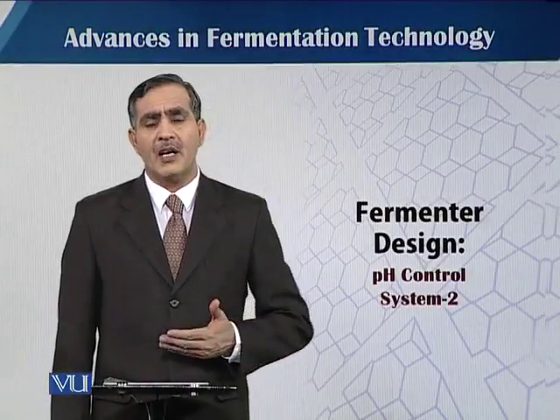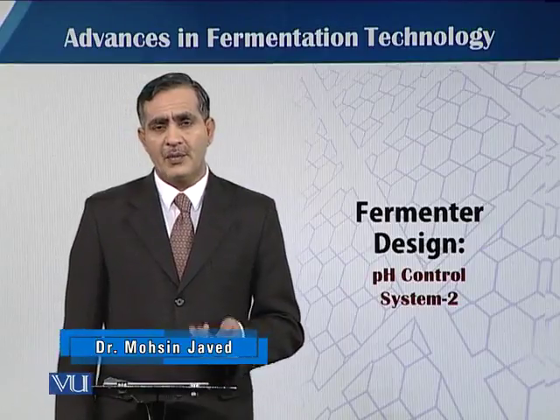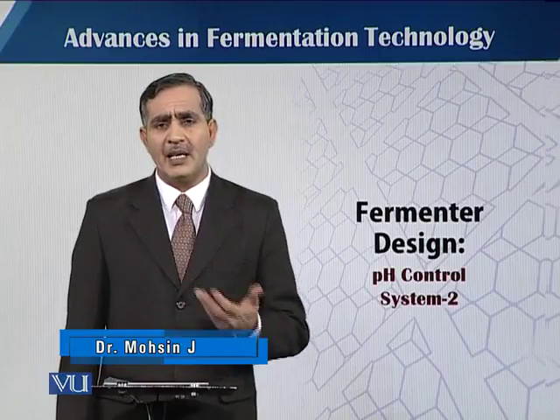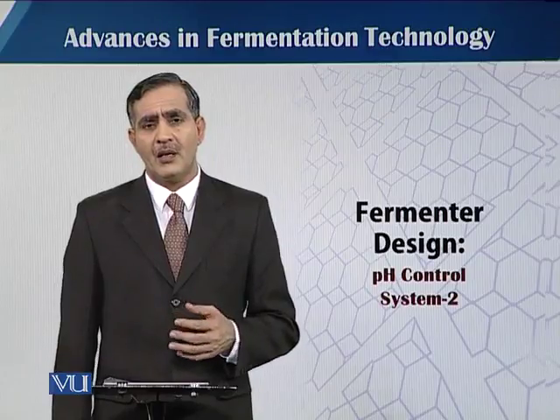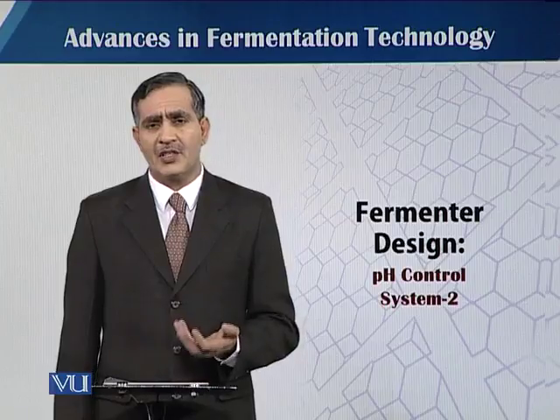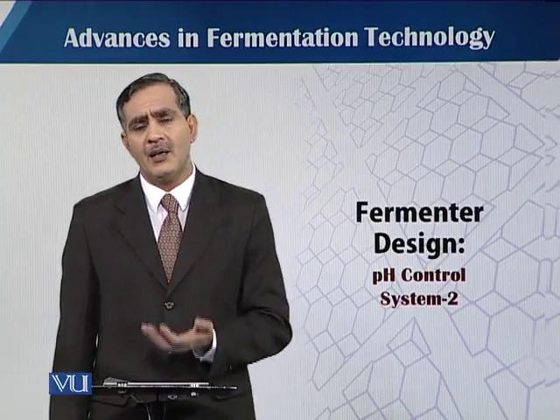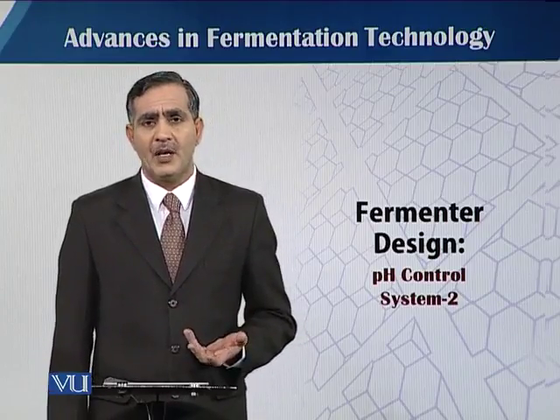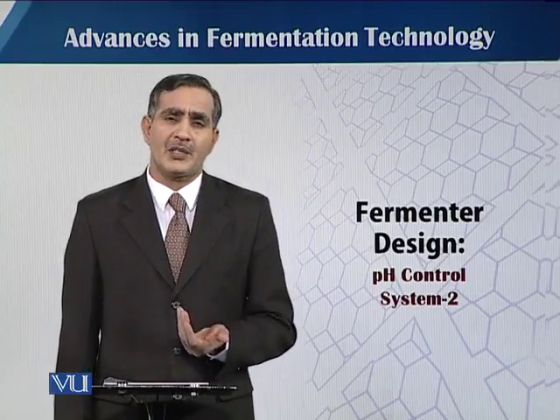In this module, we will talk about the automatic control system of pH. As we discussed in our previous module, what kind of neutralizing agent, meaning acid solution or alkali solution, they should be and what their concentration should be. We cannot use a diluted one, and we cannot use a highly concentrated material. So there is a limitation. If we have a choice, then how do we control it? Automatic control system.